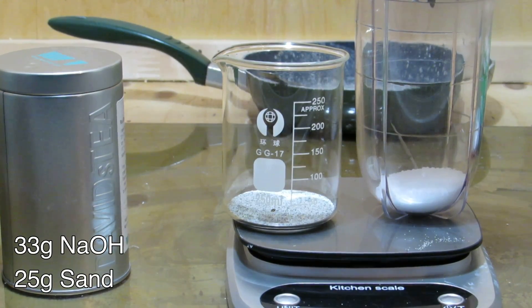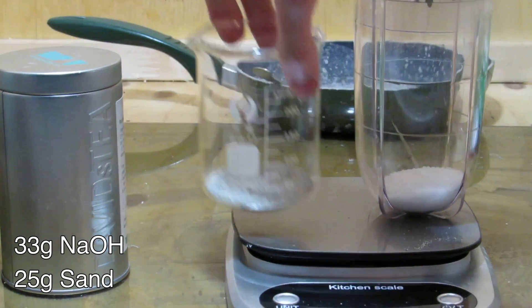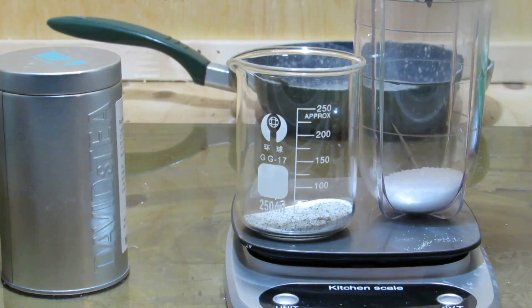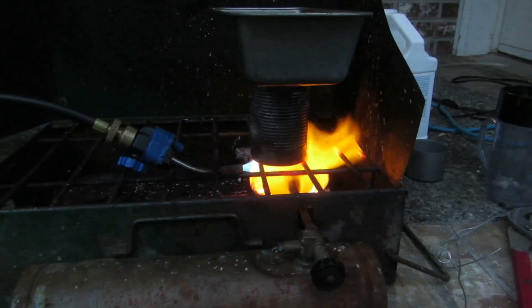We could first weigh out 33 grams of sodium hydroxide and 25 grams of sand and grind them together in a blender. The powder was transferred to a steel can and heated on a stove until everything was molten. The sodium hydroxide reacts with the silicon dioxide to form sodium silicate and water.